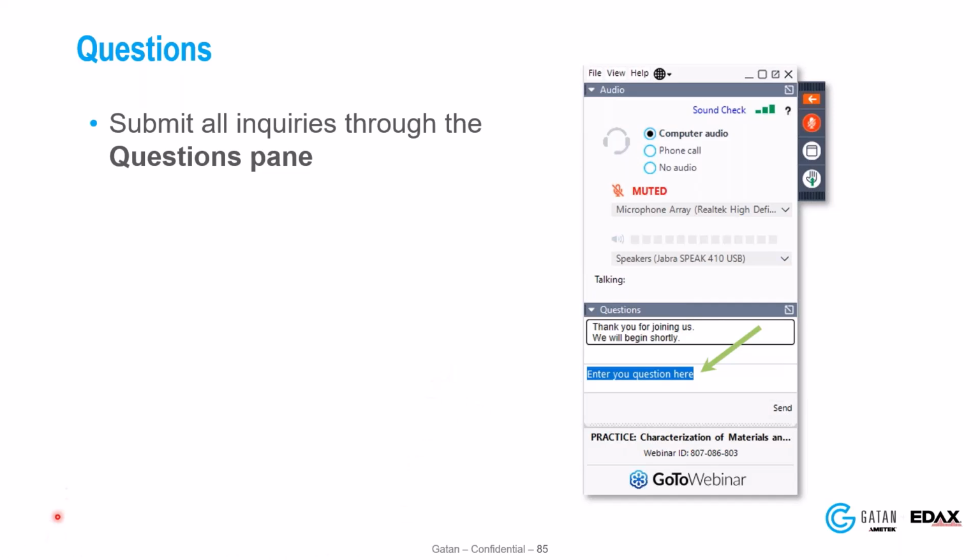You were using the NLPar then? On these, we're just NPar. Just NPar, yeah. Do you think you would be using the NLPar a little bit more? Yeah, I think some of the data that we had sent in, we tried NLPar too.